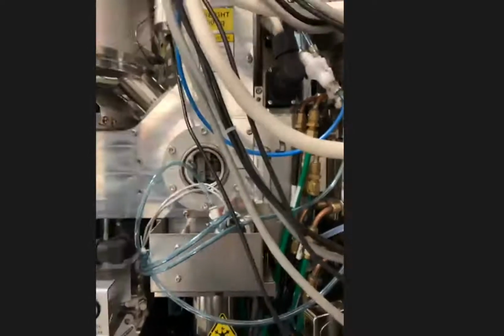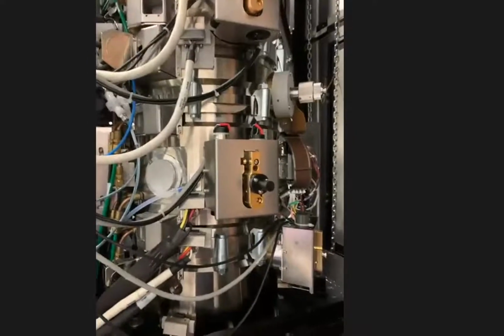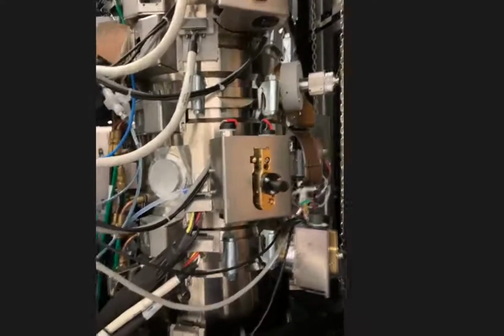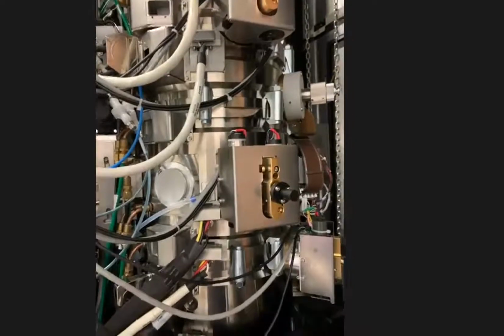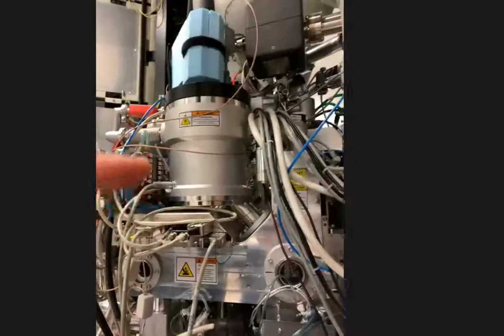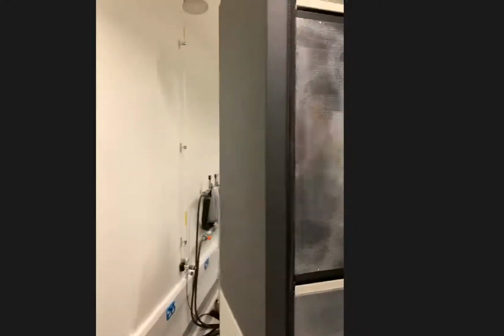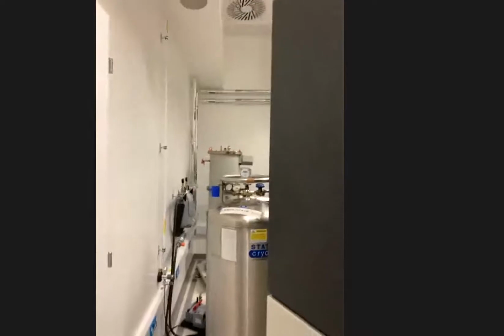That would come and grab that cassette, take it up, and then push it into the vacuum, which is where the electron beam is going. And all of it is kept cold by this dewar you see here. That's all full of liquid nitrogen that's automatically refilled by the large vat of liquid nitrogen at the back there.